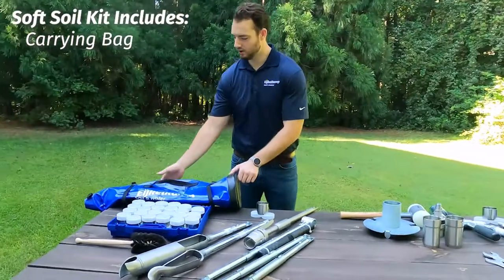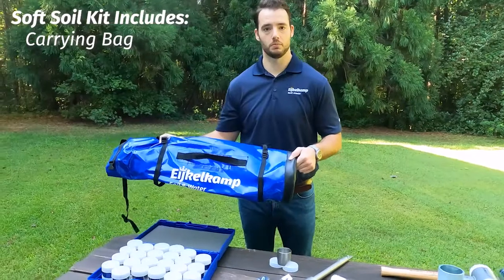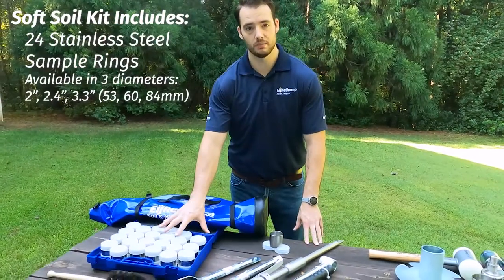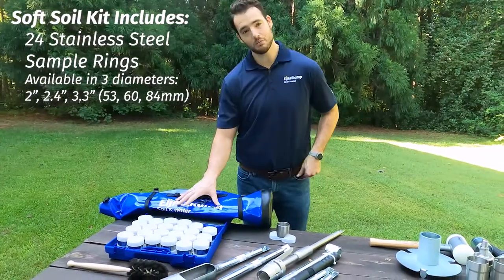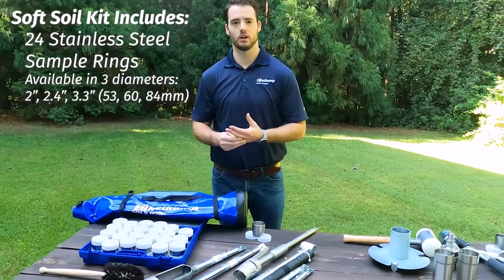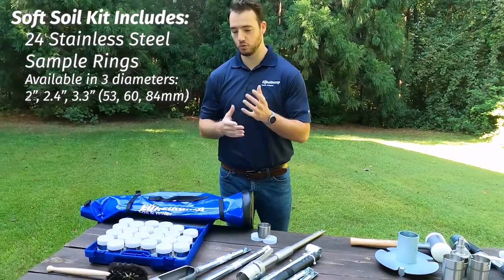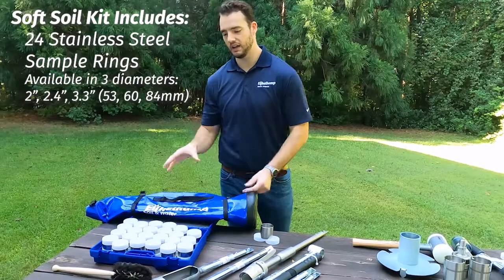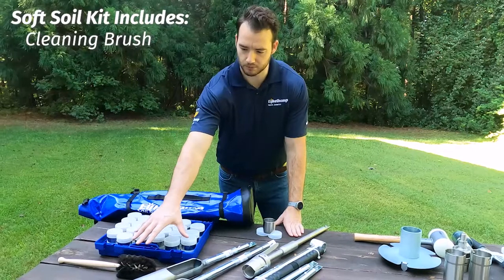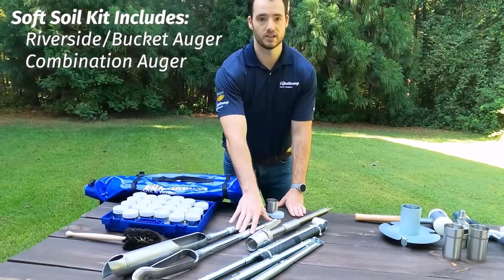Getting into it, they all come with a handy carrying bag because these are meant to go out in the field and be ready to go. They all come with a set of 24 sample rings numbered 1 through 24 typically. You can get more of these — we sell extra kits in case you're going out somewhere like the jungle where you can't come back and reuse them, and you want to do all your sampling at once. In that kit, we also have a brush to help you clean, a bucket or riverside auger, and then a combination style auger.